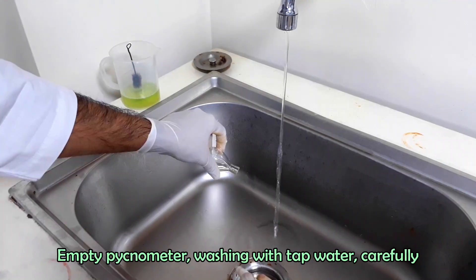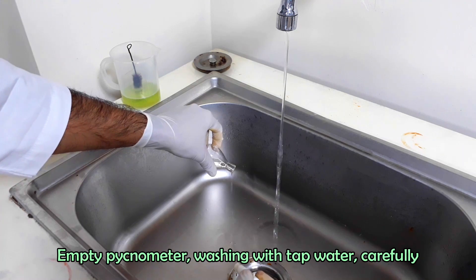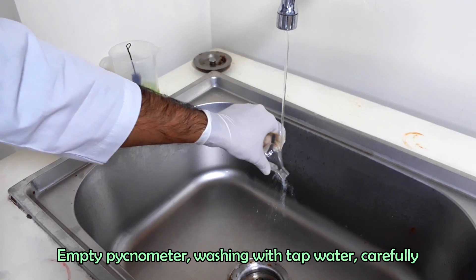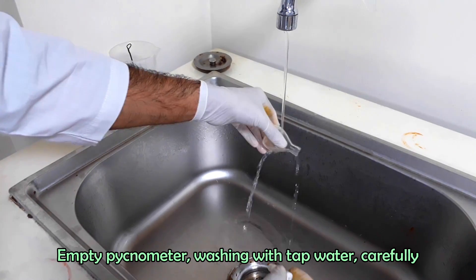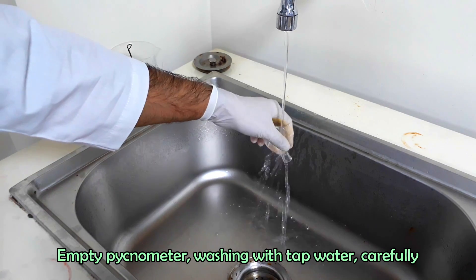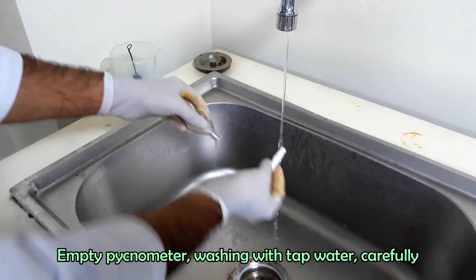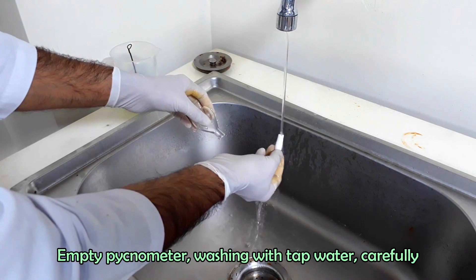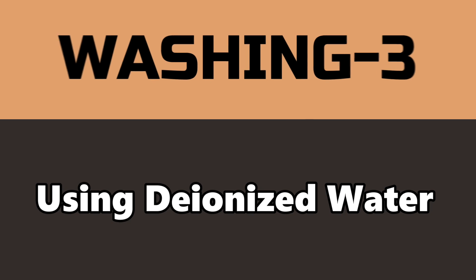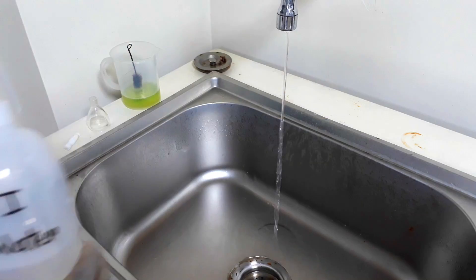Now empty the pycnometer and wash with tap water. Finally, we are going to rinse the pycnometer with deionized water.